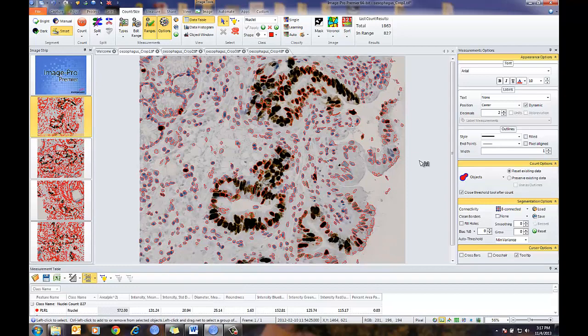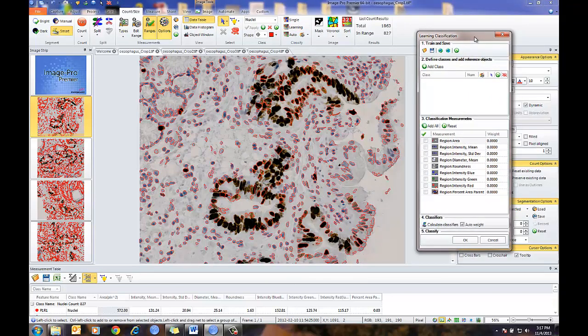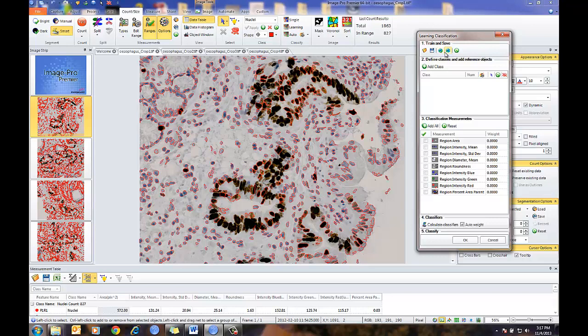I'm going to go to Learning Classification. The Learning Classification tool is a nicely structured workflow of the steps needed to classify your objects into the different categories. Starting off, we have Train and Save — this is where we can load and save settings once I have my classification scheme created. I also have Load Global and Set Global, which allow me to create a classification scheme on one image, set it, go to another image, load it, and then refine my classification scheme.